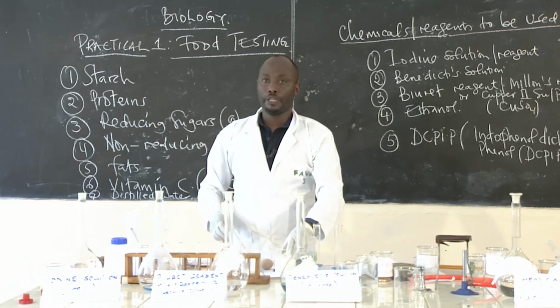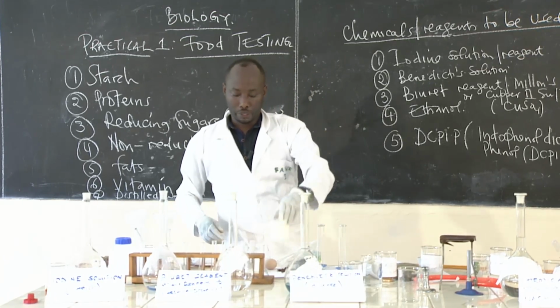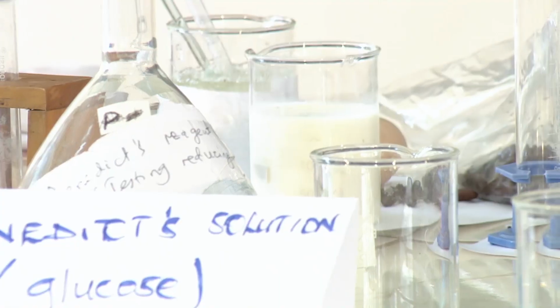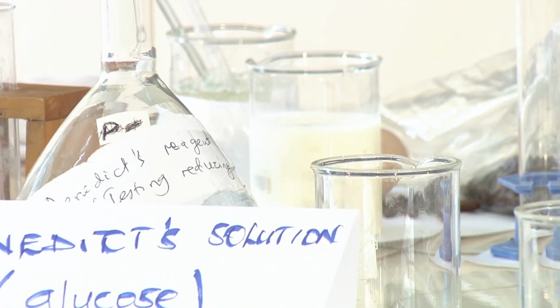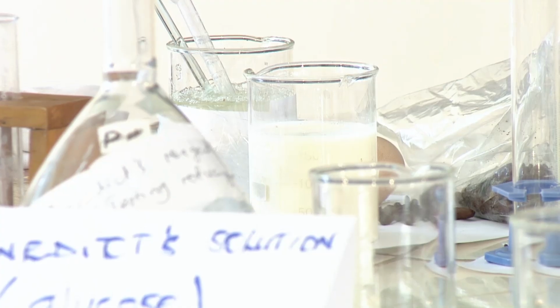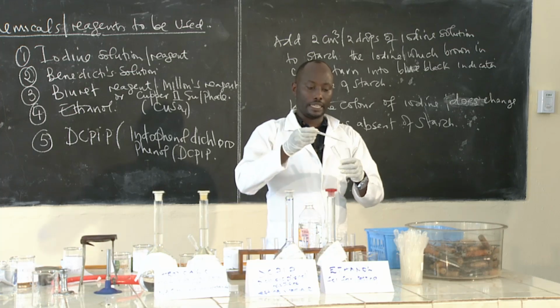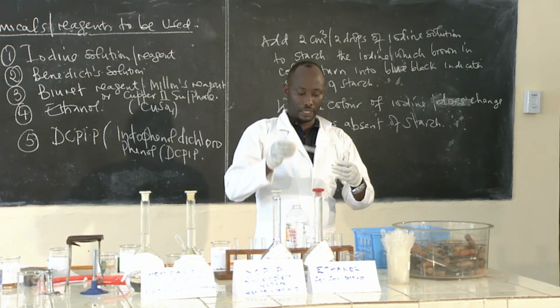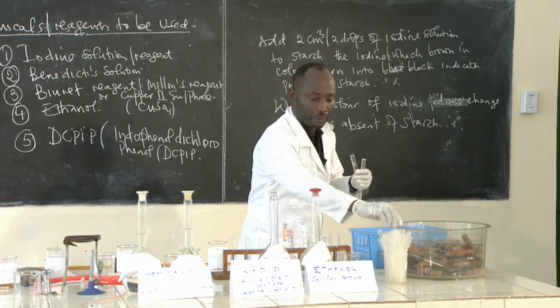Let us also use the milk. Does the milk contain proteins? I will use water as a control experiment, which will test negatively, and then I extract the milk and see if the milk contains proteins.